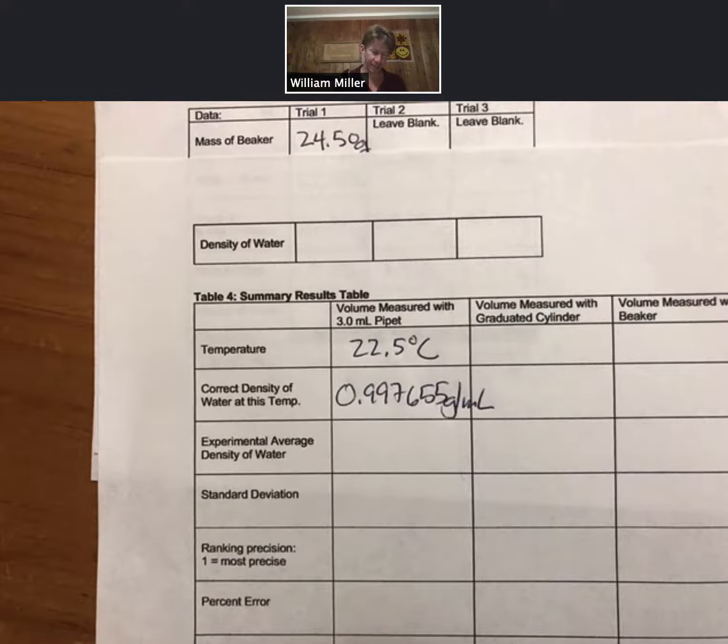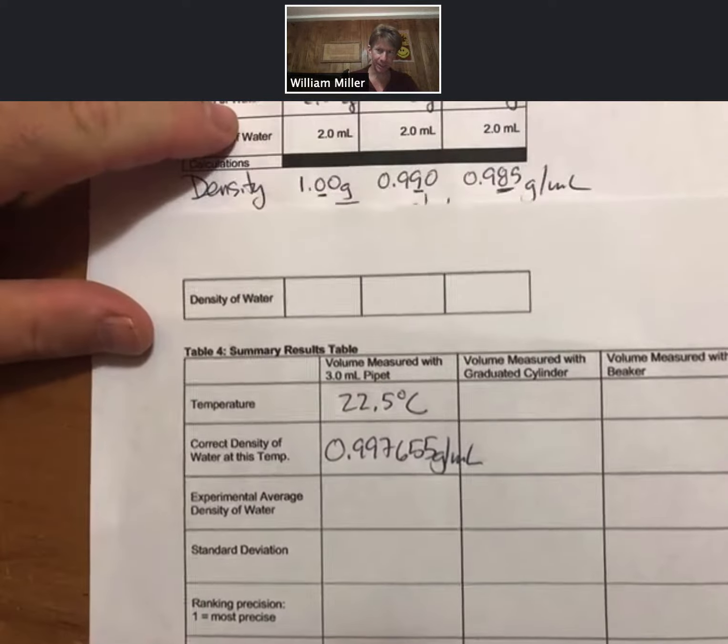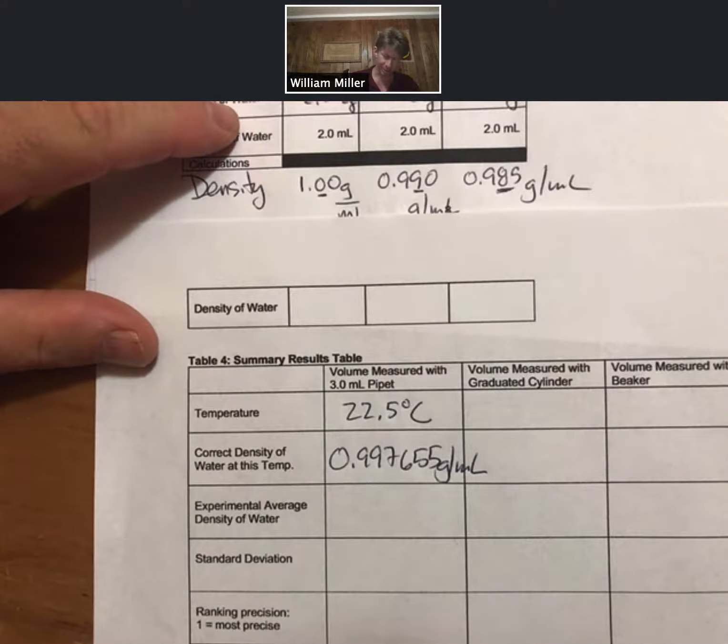The experimental average density of water is going to be the average of our 3 values. Our 3 values are 1.00, 0.990, and 0.985.